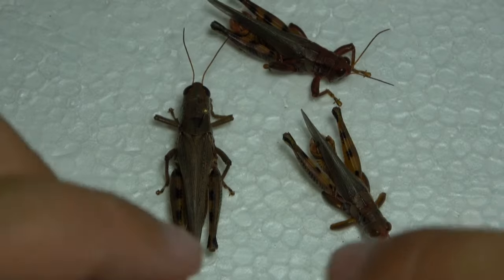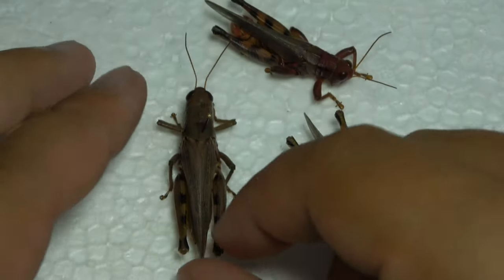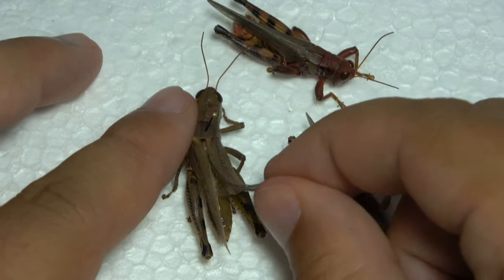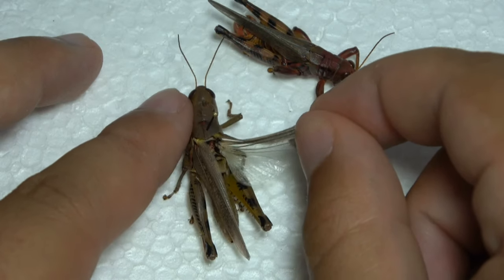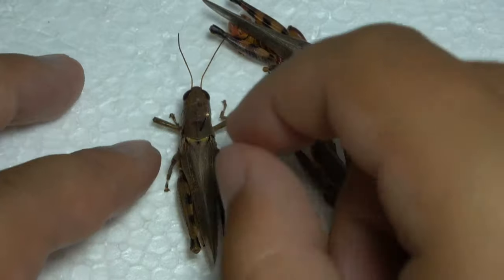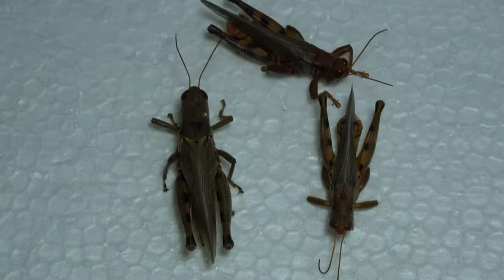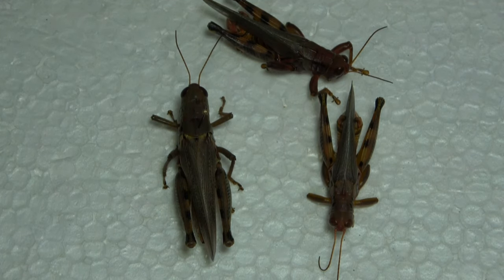Most grasshoppers, like the ones you see here, have wings. For many species — in the band-winged grasshoppers, for example — you would want to pull the wings out. I'm going to show you an example right here.